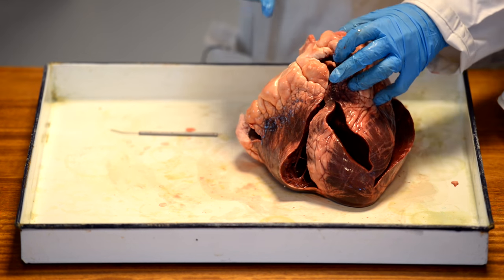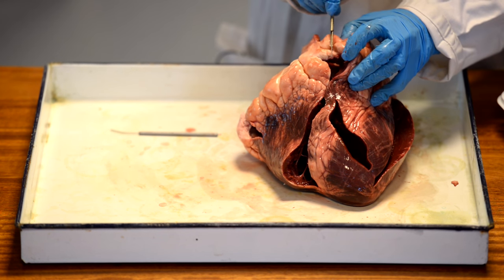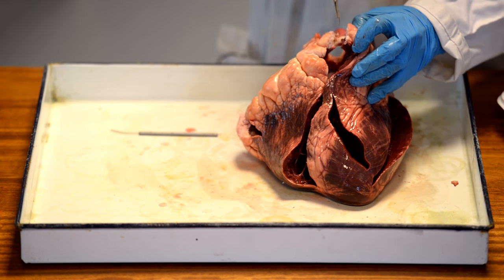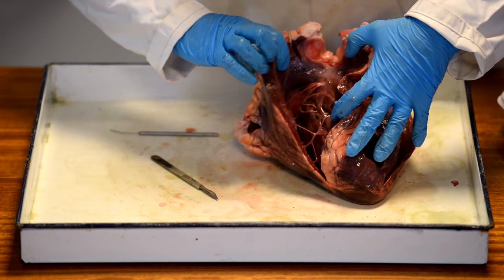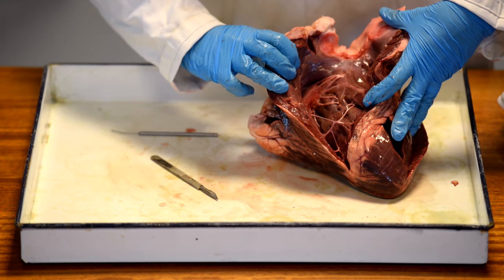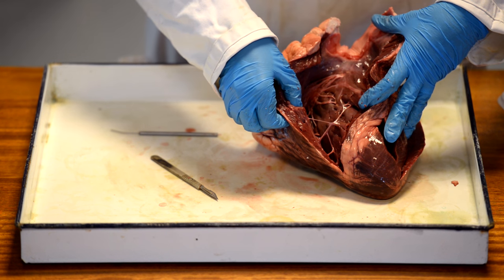So what I'm going to do now is I'm just going to carry on. I'm going to cut through all this fat. A lot of fat to cut through. I think this is a sign of a very healthy, happy animal who ate a lot before his final demise. And now the butcher's slash is in a very difficult position. But now you should be able to see how, on this side of the heart, the muscle is thin.